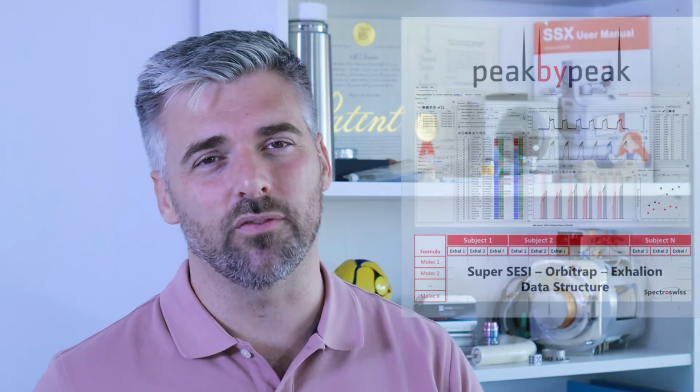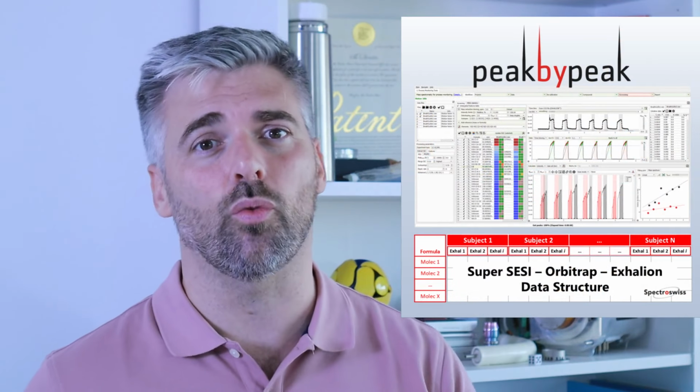Okay, so that's how you get good datasets, but post-processing this still can be a challenge, even if we have good data quality. We're talking thousands of peaks, hundreds or thousands of samples, each with a particular time evolution. We need to assign the molecular formulas, and it's not as simple as one peak equals one molecule. There are isotopes and some adducts. That requires some serious computational power, and for this, the PeakByPeak software was developed.